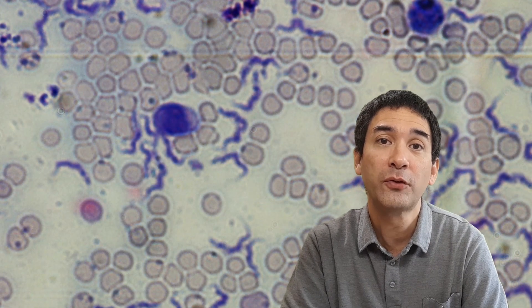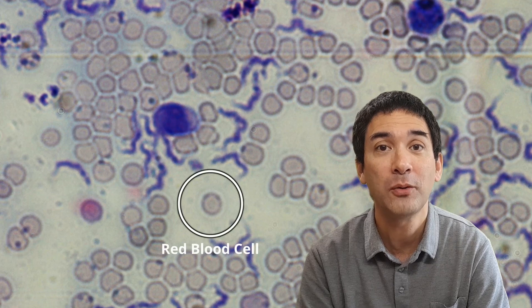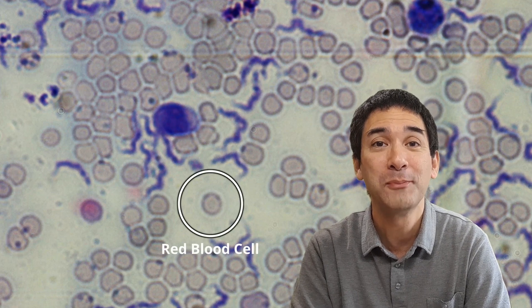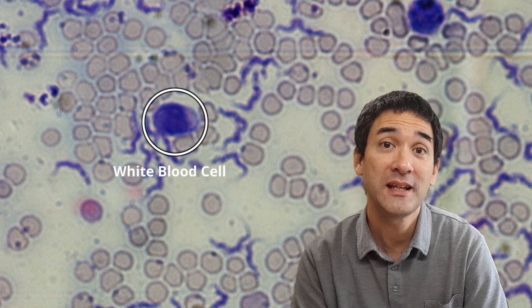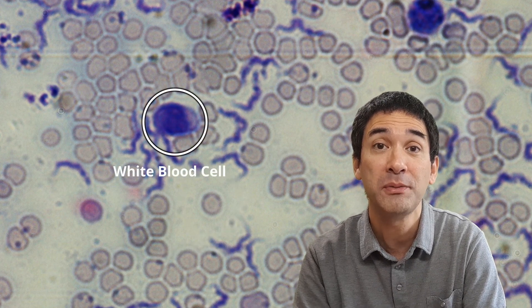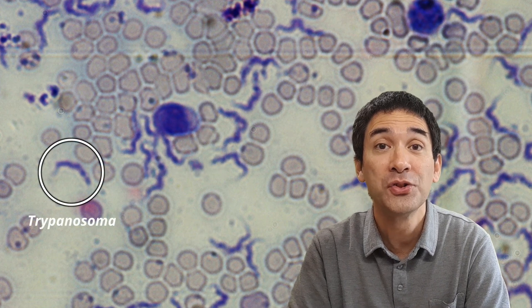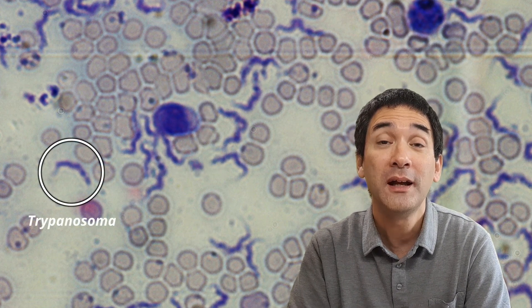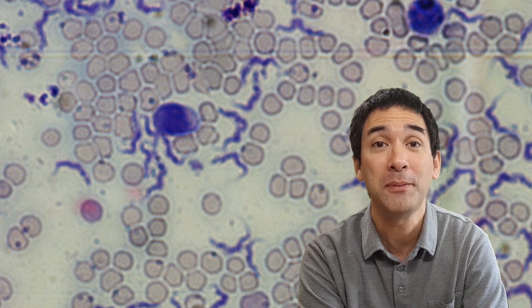You can see the red blood cells on here — they can be quite easily identified. There are many of them in a small drop of blood. There are also white blood cells; they stain purple because of the chemical used to stain them. The trypanosomas, the parasite, are also stained purple, and you can recognize them quite well by their shape.